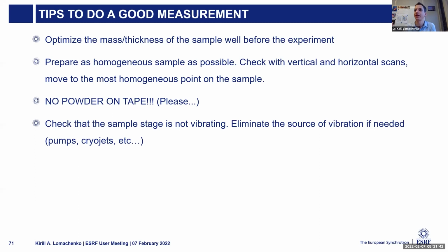So it's your actual pellet or capillary, but also the air, the windows, everything else. Apart from the obvious things, that your table should not vibrate so you don't measure in different points of your actual pellet, you should also ensure that the other conditions, what is around your pellet, also stay stable.